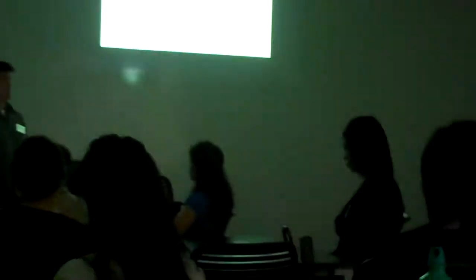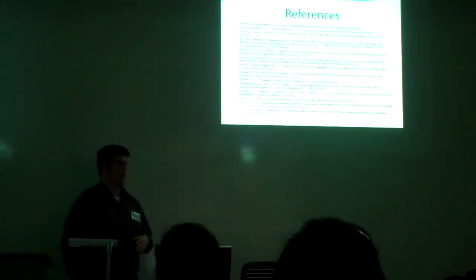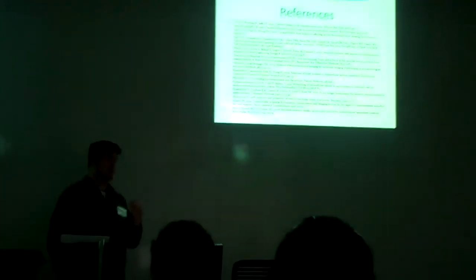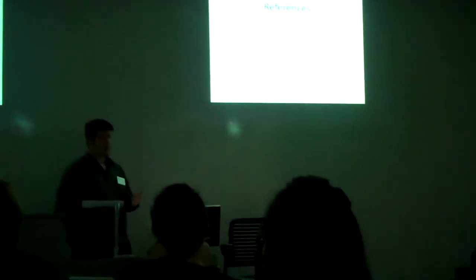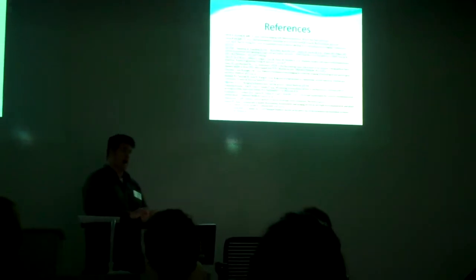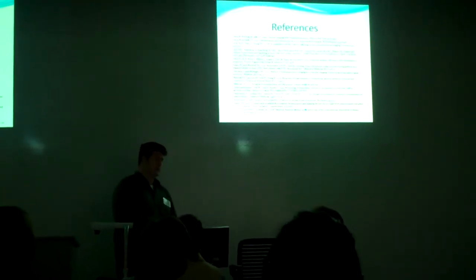Like you said, the PMTs are much more sensitive. They can detect this amount of light, as I said, measured in lumens, which is absolutely not detectable with the naked eye. And so they can detect reactions that give off minimal amounts of light, such as these. CCDs, when you get the really good high-end ones, can also be almost as sensitive, but if you want to image a reaction, if you want to look at certain organelles inside a cell, then a CCD is definitely the way to go.